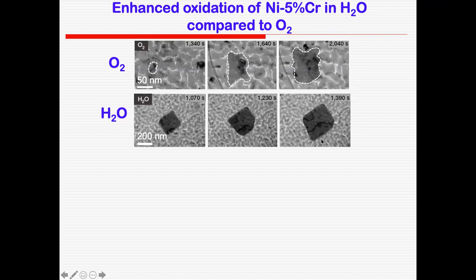And so in this case, you have more balanced diffusion of nickel and oxygen atoms, so maybe that leads to a more regular shape. But this is because of the large difference in the diffusion rates of nickel and oxygen. So we don't have a quantitative idea about the mechanism for the different morphologies, but most likely it's because of the difference in the diffusion rate of nickel atoms in these two oxide islands.